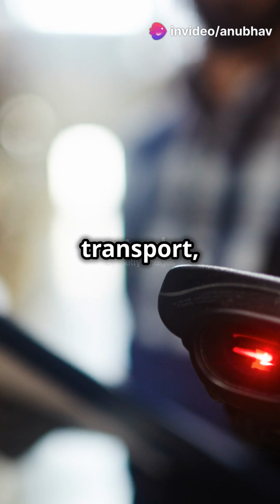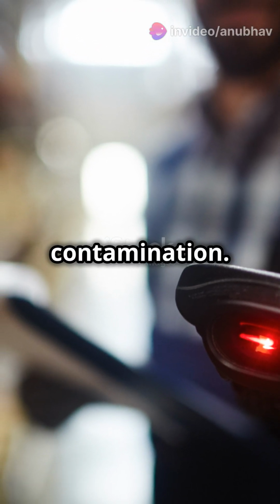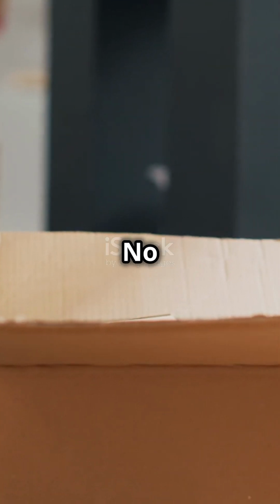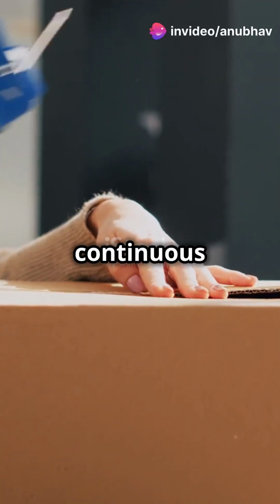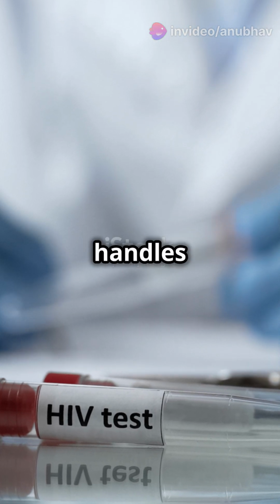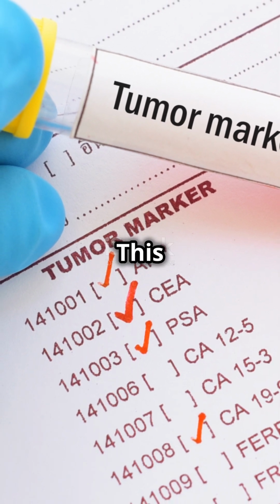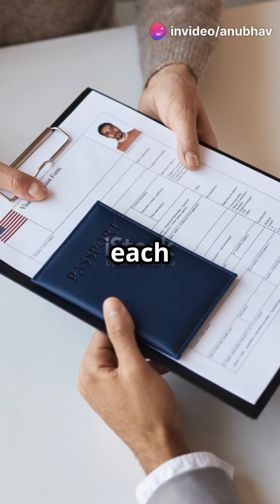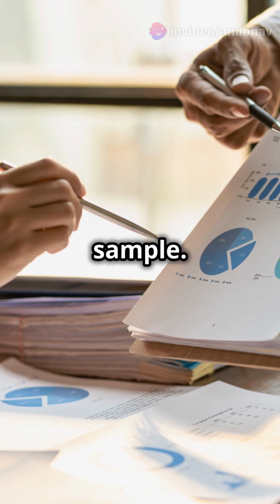During transport, samples should be sealed securely to prevent any tampering or contamination, and accompanied by the chain of custody form. No shortcuts here. This form travels with the sample to ensure continuous documentation. The form must be signed by everyone who handles the sample, confirming custody at each stage. This creates a clear trail of responsibility. This is crucial for maintaining the integrity of the sample.